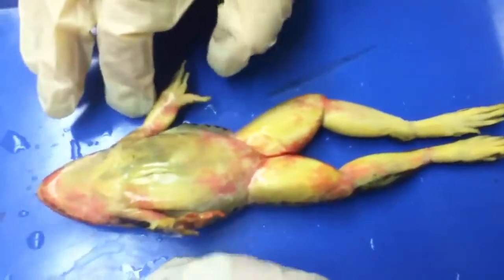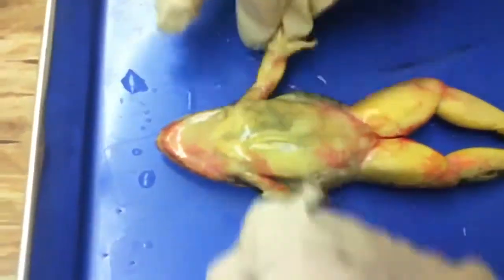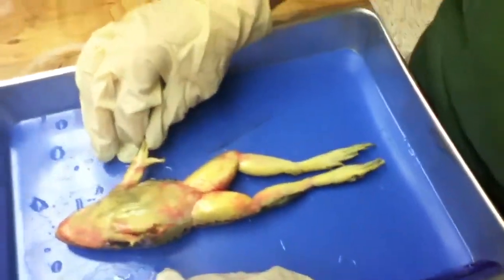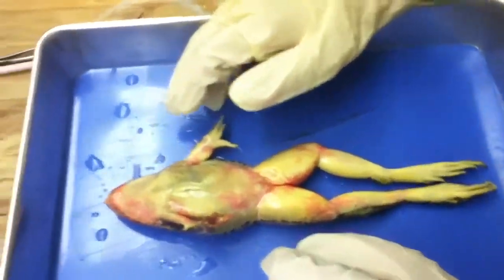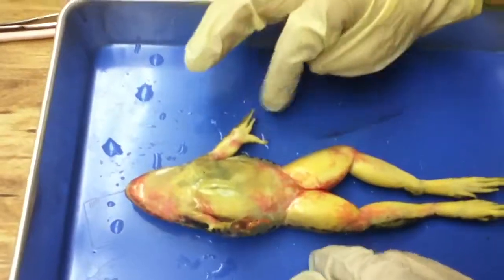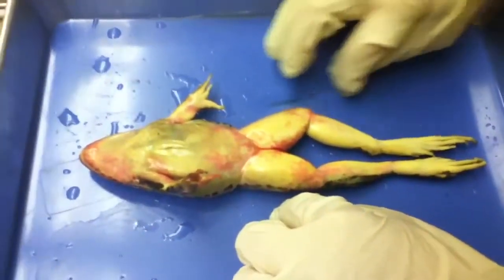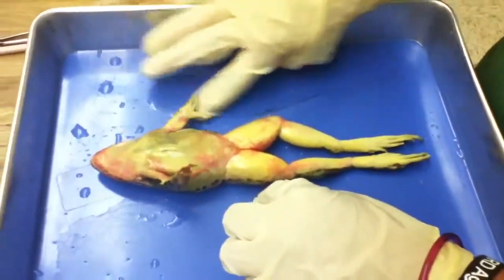If you get to the point where you're taking out the fat body, when it comes time, at the end of the period, we're going to bag our frog, label it in a plastic bag so that they'll be good for the next period that we come out here. I'll have a bag available for you to put the frog parts in. We don't put them down the drain, we don't throw them in the trash, we have to dispose of them.